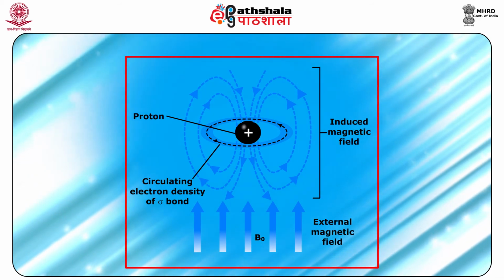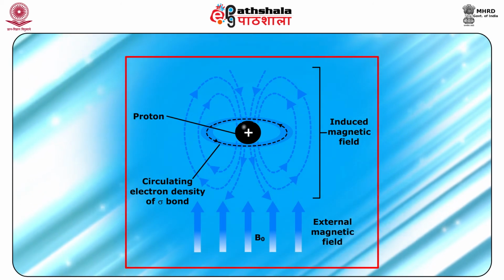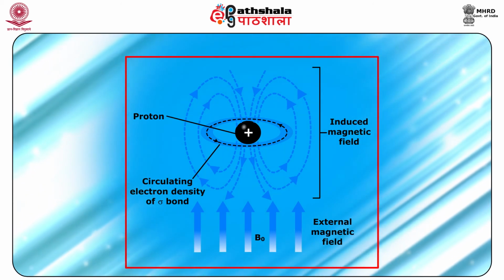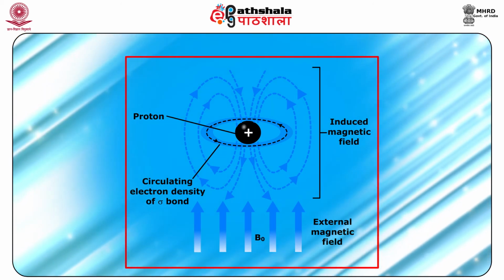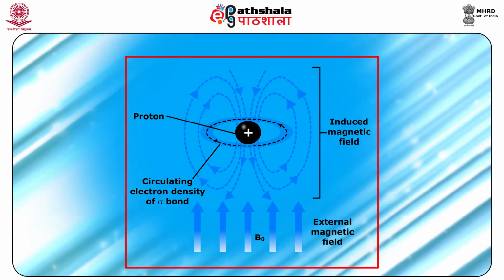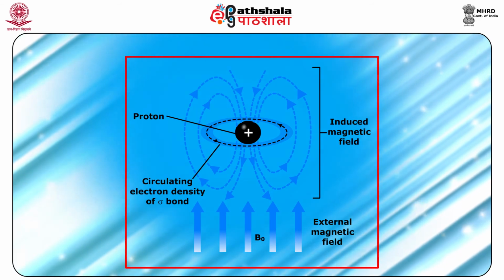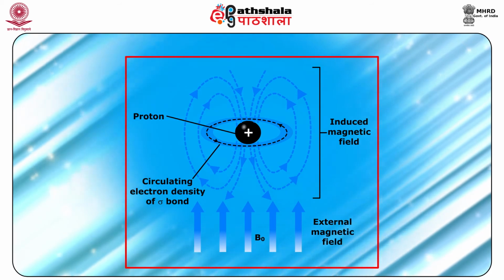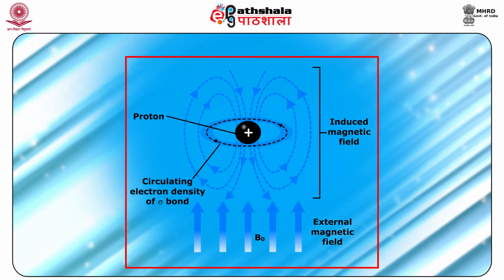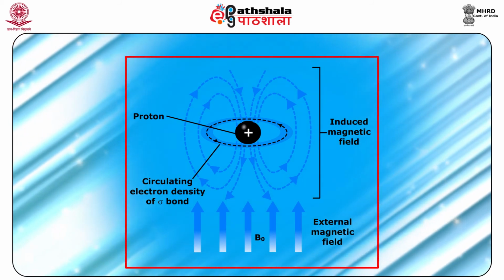This phenomenon of shielding and deshielding allows the exploration of the different chemical environment of each hydrogen atom in a molecule. Thus, it is very important to assign the ppm values in the NMR spectrum and decide the different kinds of protons in various unknown molecules, and this makes NMR such a special technique to allow us to determine what an unknown compound contains.